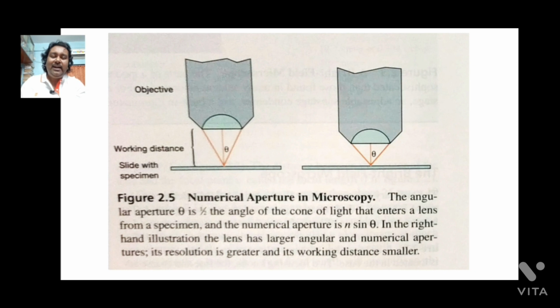If the refractive index of the medium is not changed, refraction of the light will not occur. So, in the case of the 100x oil immersion objective, the image is much brighter with the use of immersion oil.